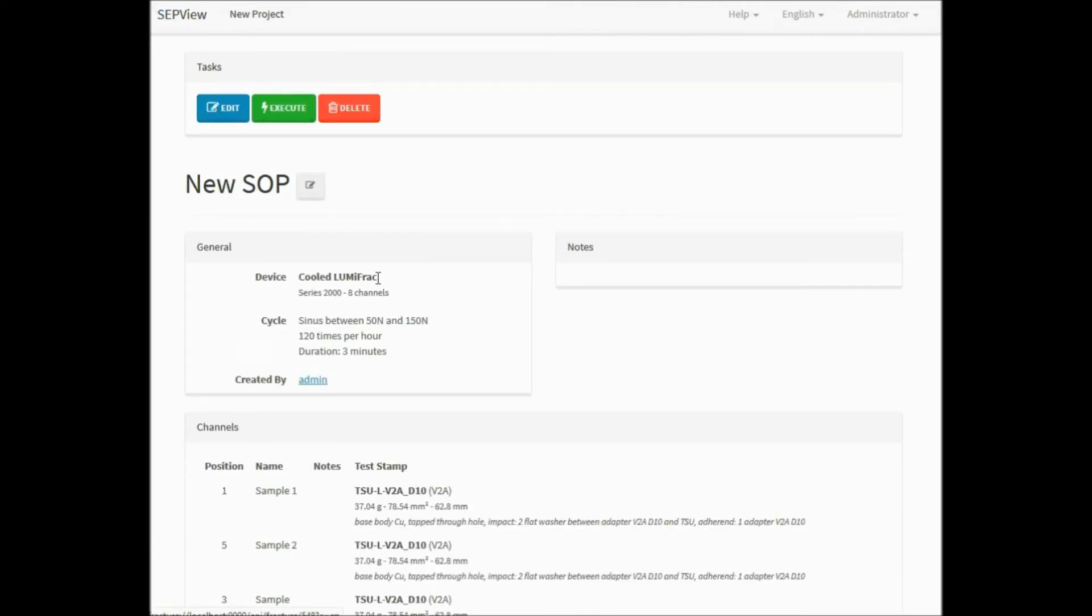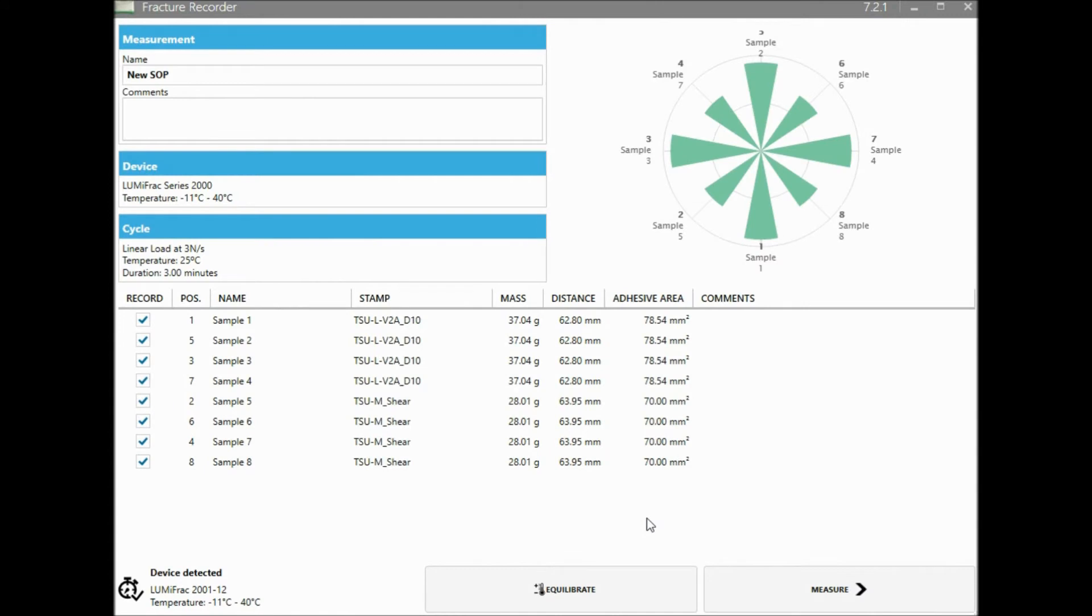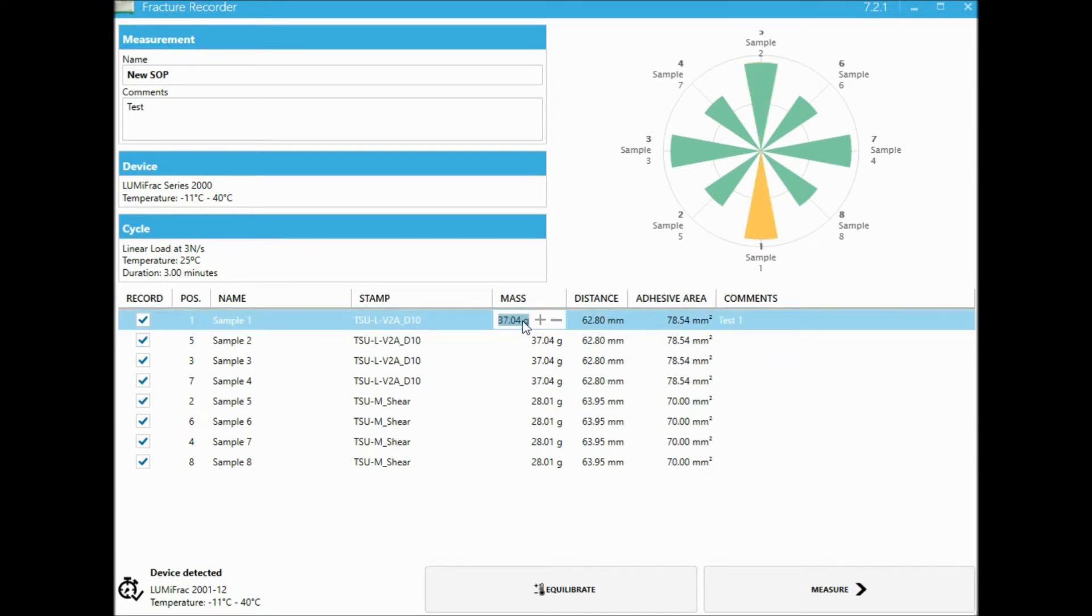Clicking on the Execute button advances you to the fracture recorder. Here you can change measurement name, sample names, masses, distances or areas if desired. You can also add additional comments to the measurement and individually for each test specimen. The device is shown in the lower left section of the fracture recorder window with information on rotor balance at the top right side. See here how we can adjust all the different settings for every sample at once.